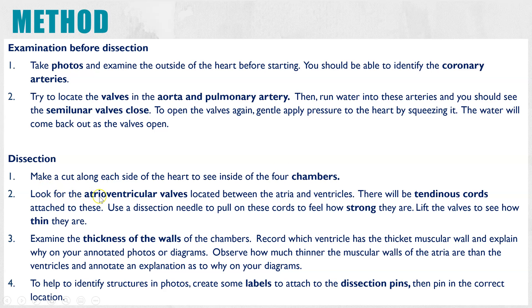Once you've done that, you should be able to identify the atrioventricular valves, which are the valves found between the atria and the ventricles. There are long thin white tendinous cords attached to them. Try using the dissecting needle to pull up on those cords slightly — you'll be able to feel how strong they are. By lifting the tendinous cord you should also be able to see the valves; they're so thin you can actually see through them. Document that in a photo so you can annotate it in your write-up.